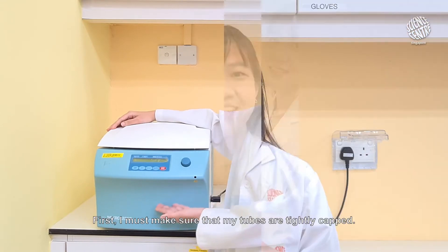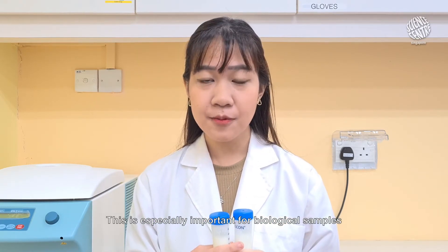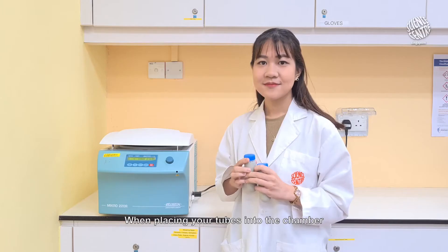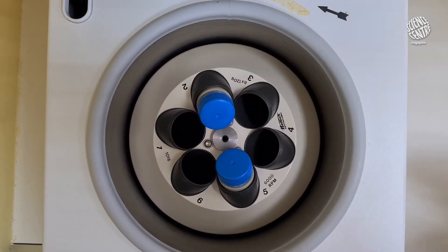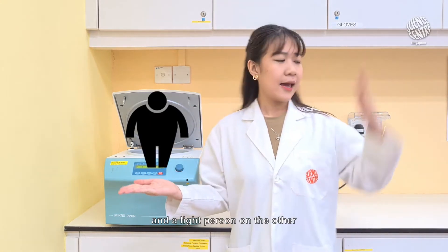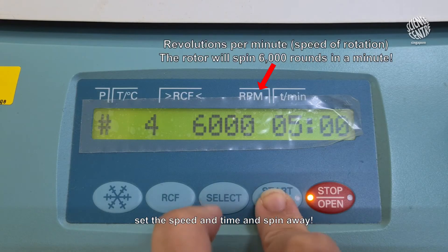Let me show you how to operate this. First, I must make sure that my tubes are tightly capped before placing them inside. This is especially important for biological samples because you wouldn't want them getting everywhere. When placing your tubes into the chamber, remember to balance them so that they are evenly spaced apart. Just like a merry-go-round with a heavy person on one end and a light person on the other, an unbalanced load can badly damage your machine. Close the lid, set the speed and time, and spin away!